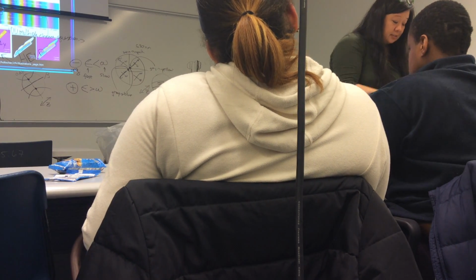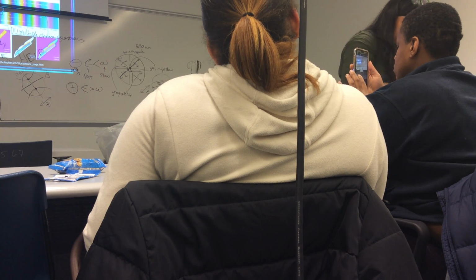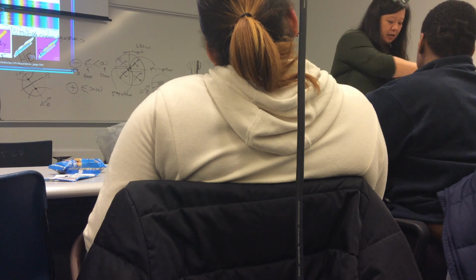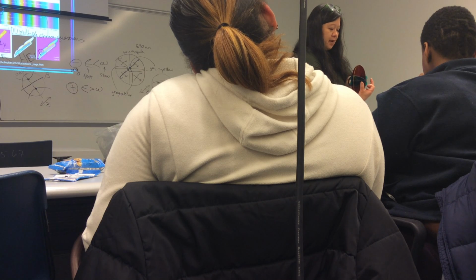And so I can see from my indicatrix figure that if I can figure out that these brushes, the line that connects the centers of them, has to be the optic axial plane, then I'll know that this must be the beta direction. That's beta. This is either alpha or gamma. But from my indicatrix figure, I can see that this direction has the smaller refractive index compared to this one.